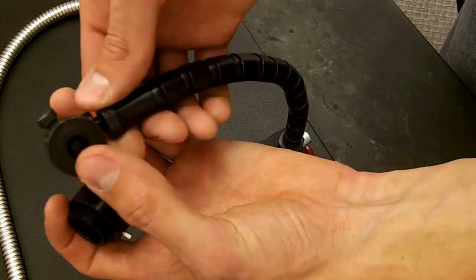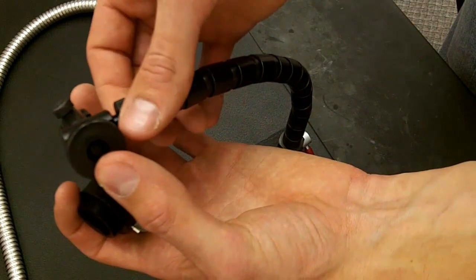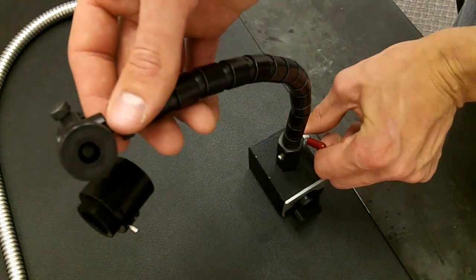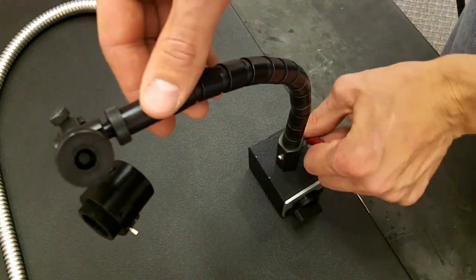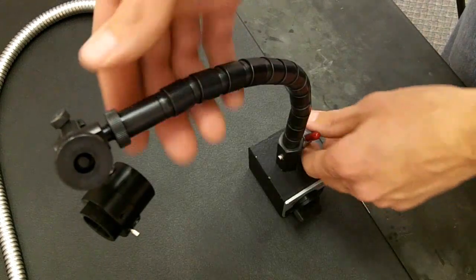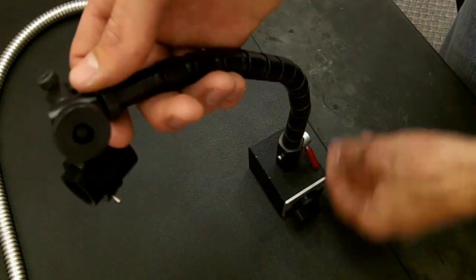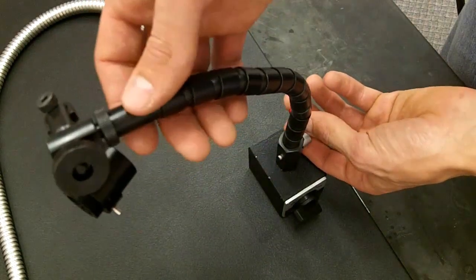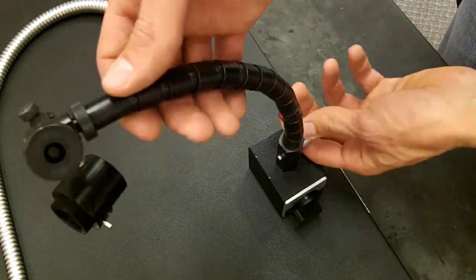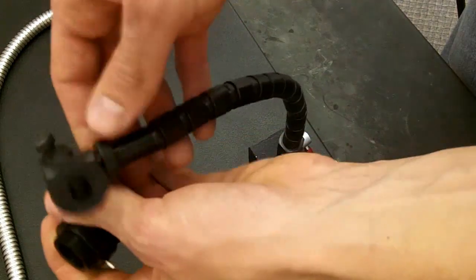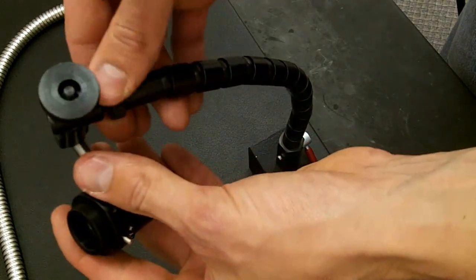Then this knob is the fine adjust for the rigidity of the arm. Tightening it makes the arm more rigid and loosening it makes the arm less rigid. Depending on your preference and what you need you can adjust the rigidity of the arm.